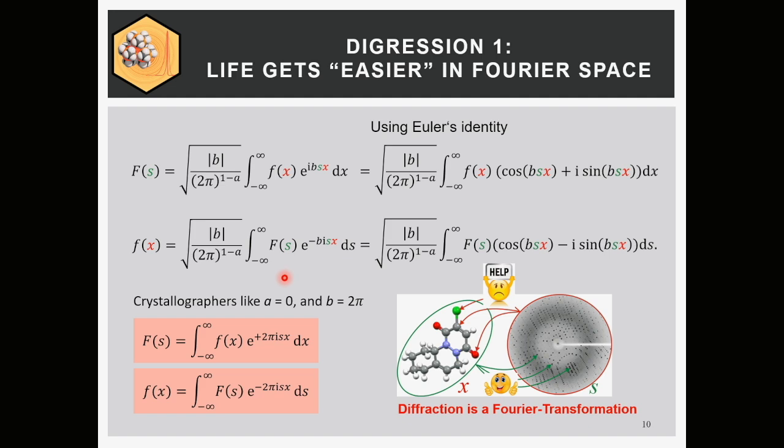This is the one we have down here, and you probably all recognize that this is our structure factor, right? Osana was showing the structure factor this morning. If we say for a moment this should be the structure factor, this is the integral from minus infinity to plus infinity of the scattering power of x, basically the electron density, times e to the 2 pi i s x dx, and the other way around.